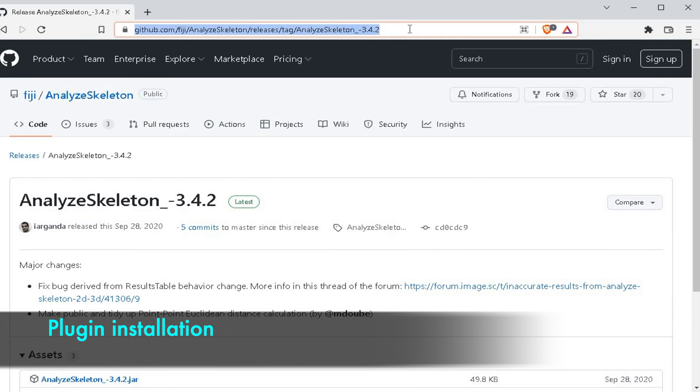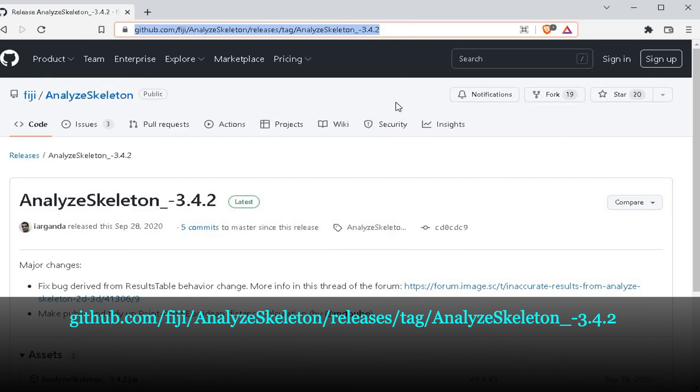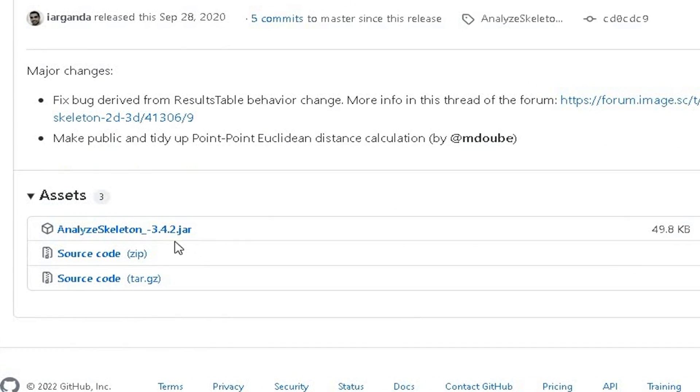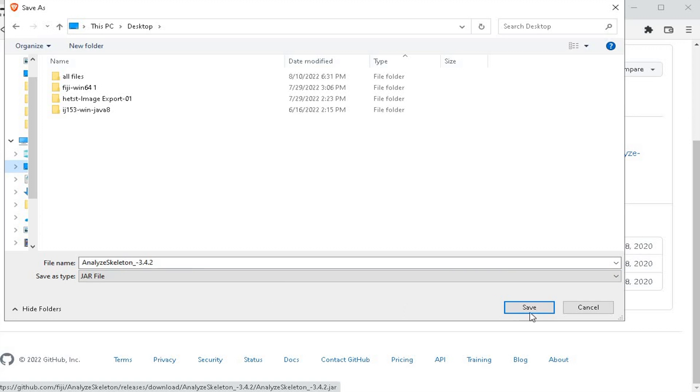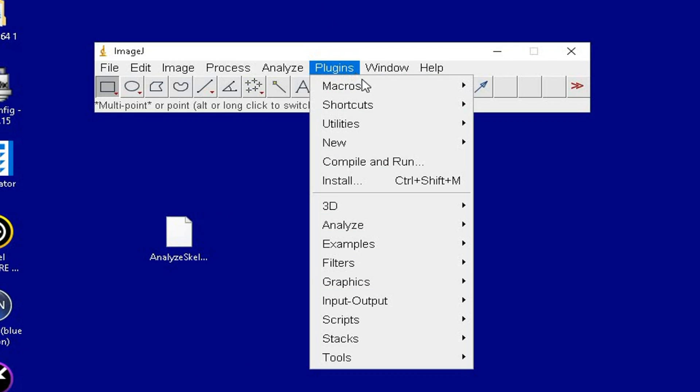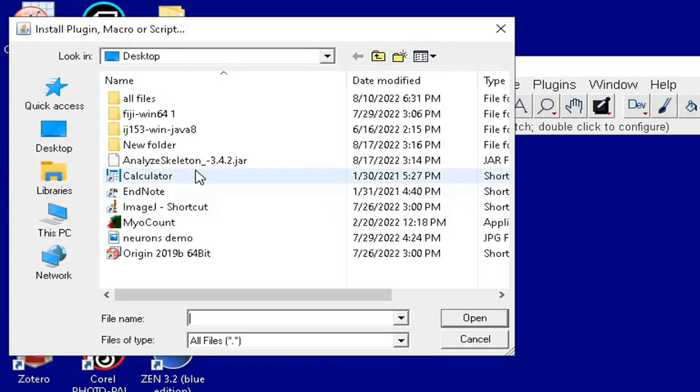This part of the tutorial shows you how to install the Analyze Skeleton plugin to analyze the neuron branches. Head on to the website as shown on the screen, click to download and save it. Next, open the ImageJ software, click on Plugins, and install the downloaded file and click Save.